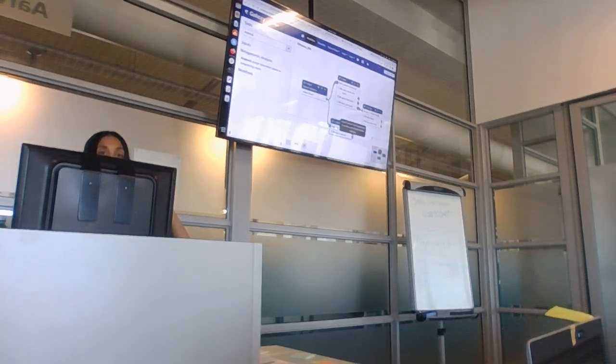And obviously from Kraken you could also drag the output to something else, so you can build a whole workflow saying this is the input for this, and then the output of this goes to this, but in our case, obviously it's not going anywhere.